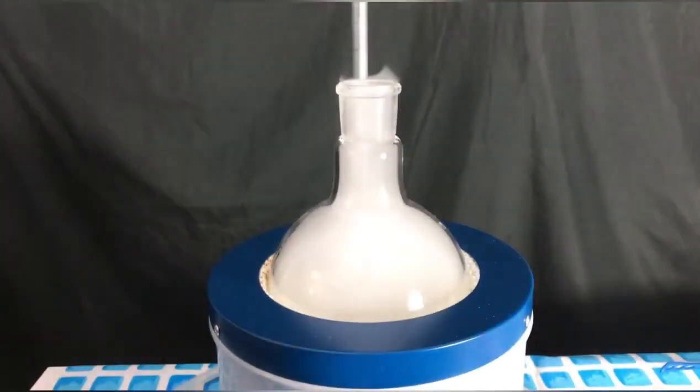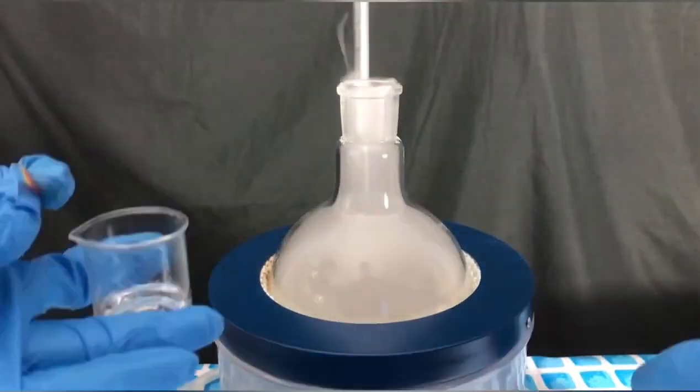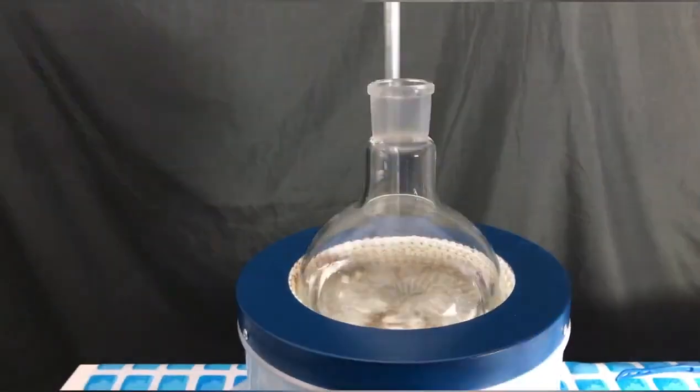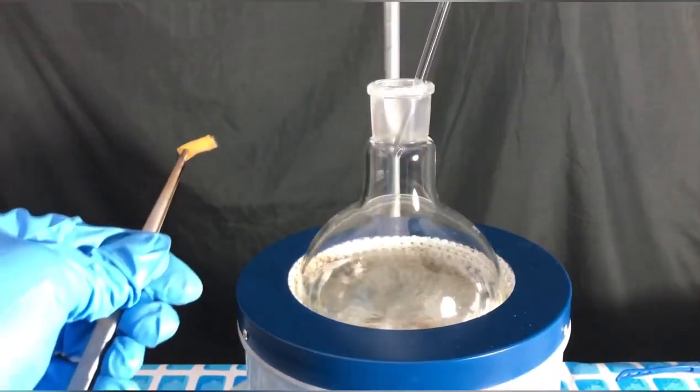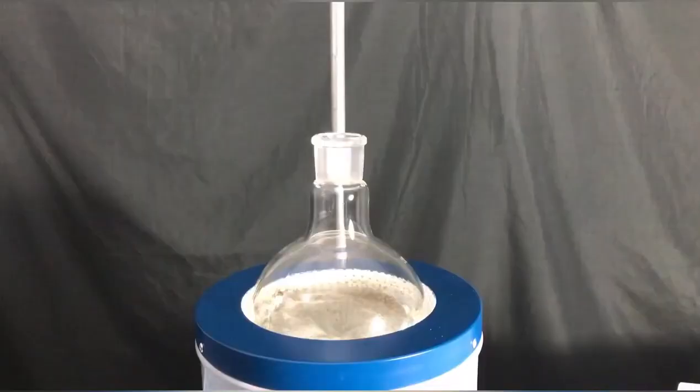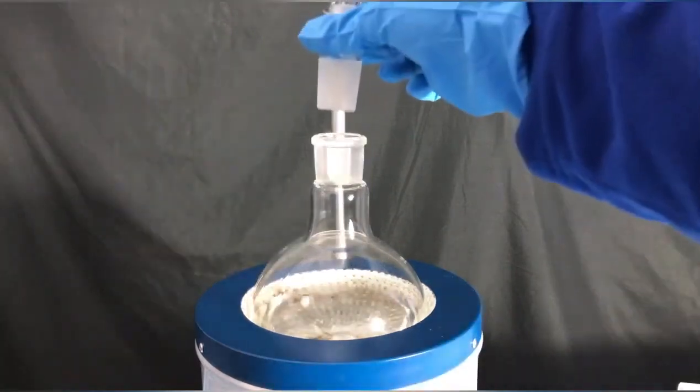In total, approximately 40 milliliters of 33% hydrochloric acid were added until the solution was slightly acidic. At some point, the pH paper turned red. This meant that we were finished with the acid addition. The round bottom flask was stoppered and put into a fridge.